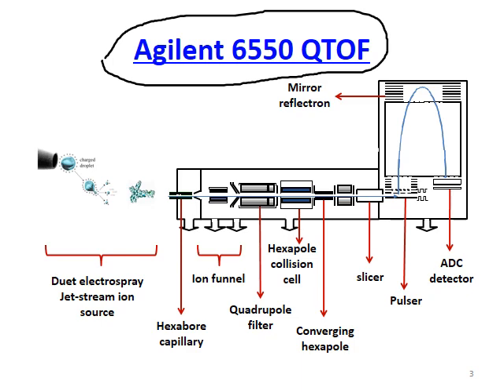Therefore, any design that helps ions be generated with minimized loss and also helps transmit the ions to prevent ion loss, all these strategies are going to help to deliver high sensitivity.